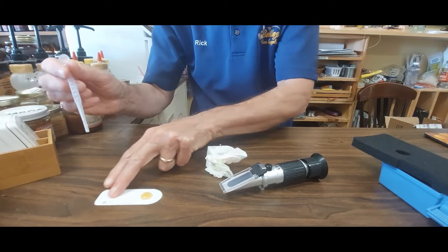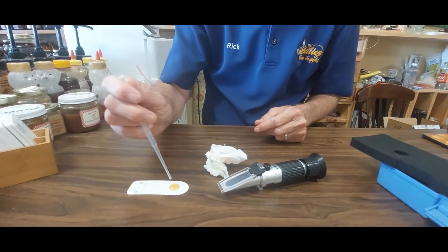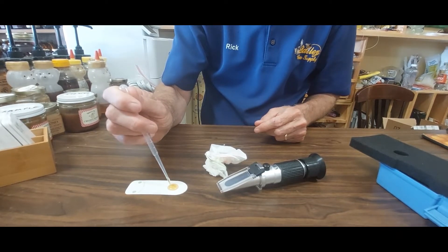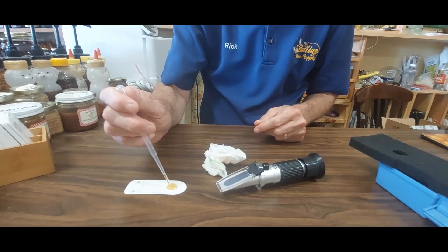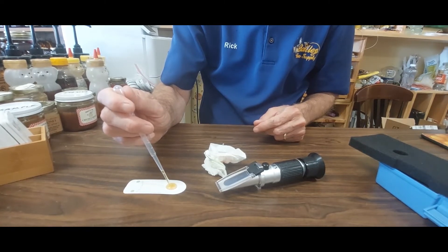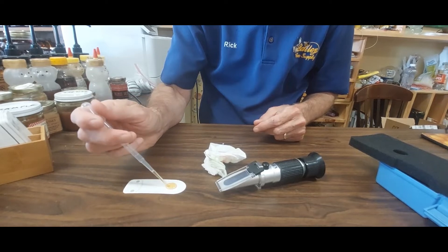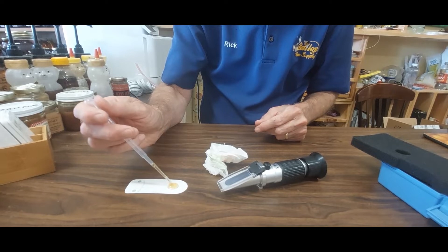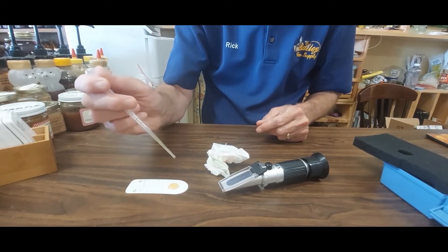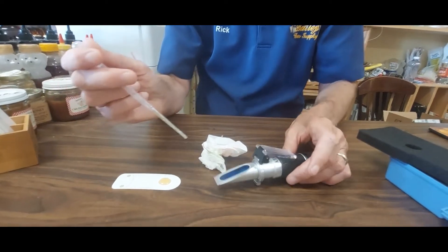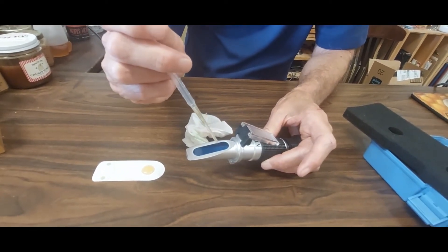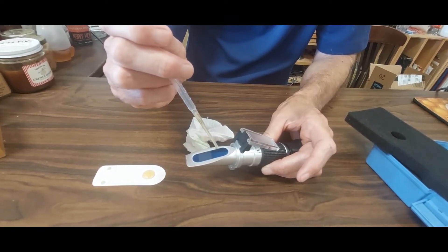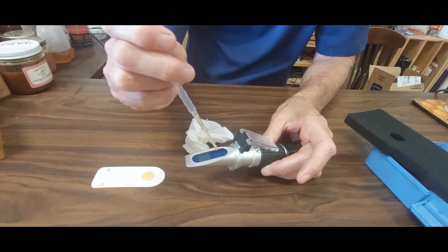I've got a honey sample here, and I'm going to use the little dropper to suck up my sample. It doesn't take an awful lot. Should be enough there. Open it up. Probably a couple of drops. And I believe this honey may have been too thick to do this.